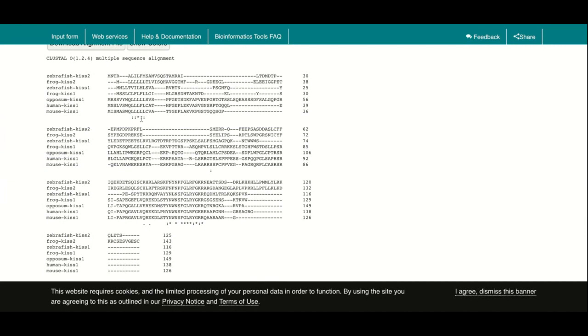How about the star? Let's see what the star means. In that spot, the star was isoleucine. Oh, yeah, leucine, leucine, leucine. They're all L's. Then you know that star means something. Is it when it's only L's? Then you see another star down here. Let's see what that means. Oh, it's all N's. Is it only when it's L's and N's?